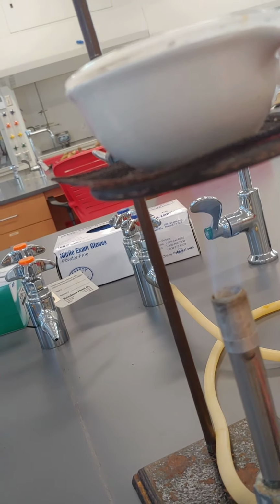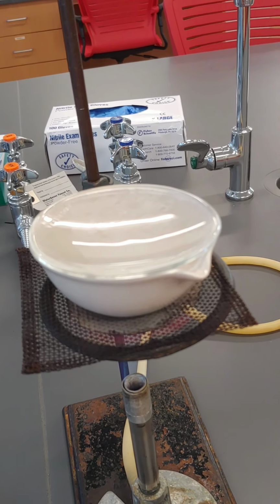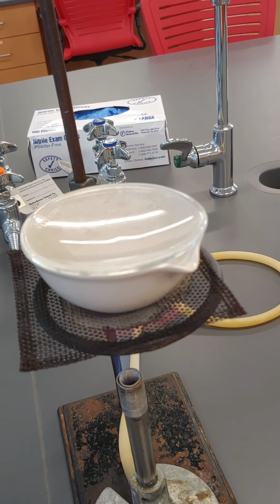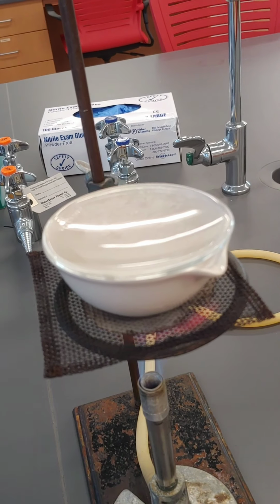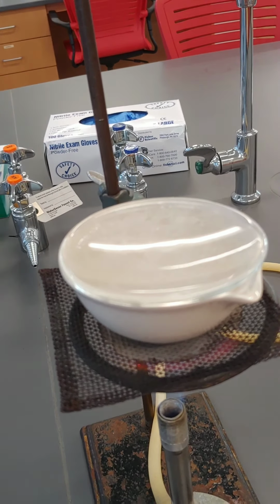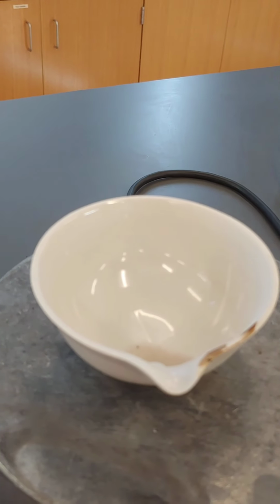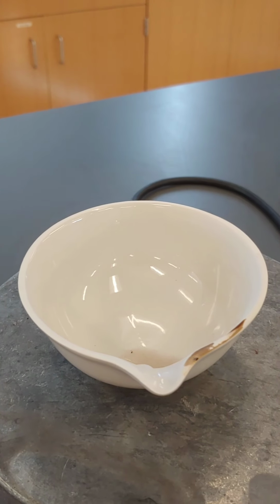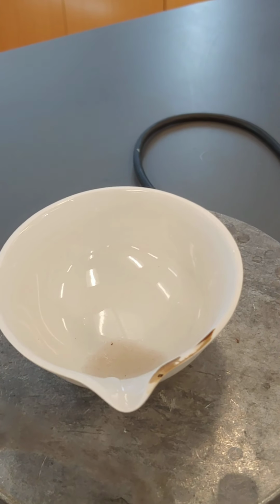We'll be able to see at some point steam coming out of the opening there. You'll see some water condensing on the inside of the watch glass. You'll also probably see some salt starting to crystallize on the top of the watch glass. So we will let both of these samples evaporate. We have the salt water here. We're going to evaporate off all the water, and we're going to be left with dry salt. And then over here in this other evaporating dish, I have my wet sand, and I'm evaporating off the water from that, and I will be left with dry sand.